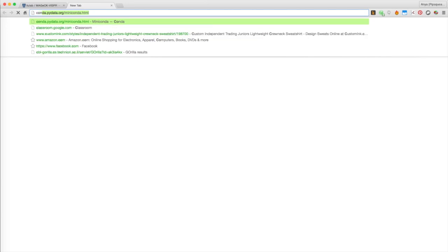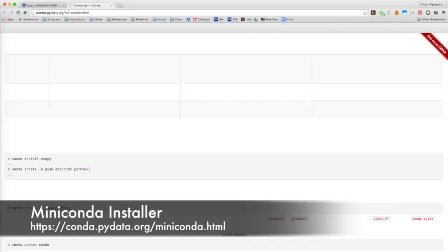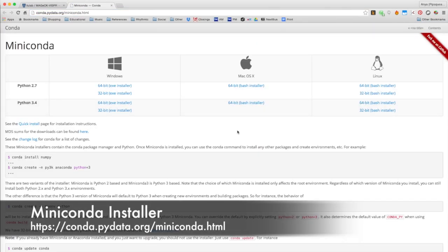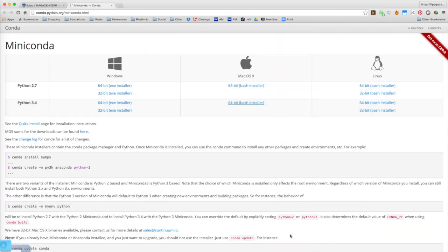First, you'll need to install Miniconda. In your browser, visit conda.pydata.org/miniconda.html to download the installer.